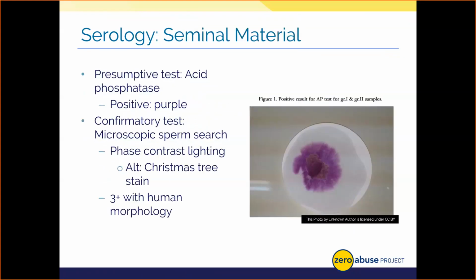All right, transitioning again, let's go ahead and discuss semen-based testing. Acid phosphatase, or AP, is an enzyme found several times higher in concentration in semen than other bodily fluids. Because it's so much higher in this fluid than any others, it gives off a very distinct reaction in this test method, making it the tried and true go-to target for preliminary seminal fluid testing. AP testing isn't confirmatory because, for example, it's also present in urine, feces, and vaginal secretions. So we need a confirmatory test to follow up on the results from a positive AP test.